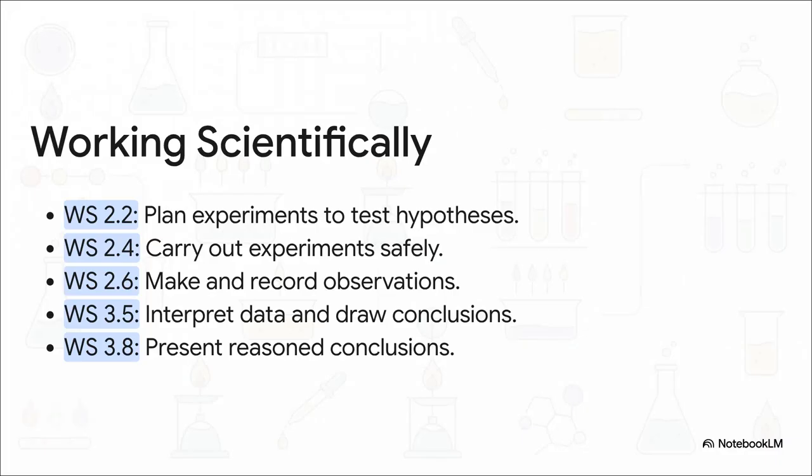And when you're in an exam situation, they're assessing a whole bunch of skills. They call it working scientifically. So you're showing that you can plan an experiment, that you can carry it out safely, that you can actually see what's happening and record it properly. And most importantly, you're showing that you can take those observations and figure out what they mean, to draw a proper conclusion. It's a huge part of your final grade.